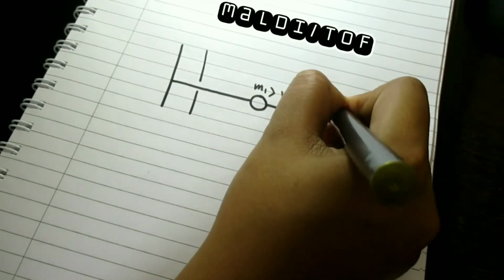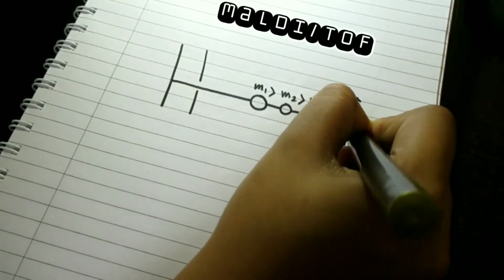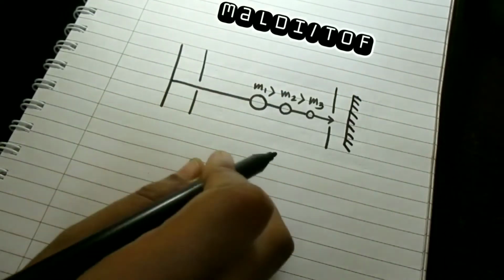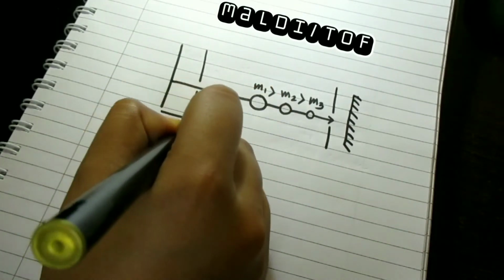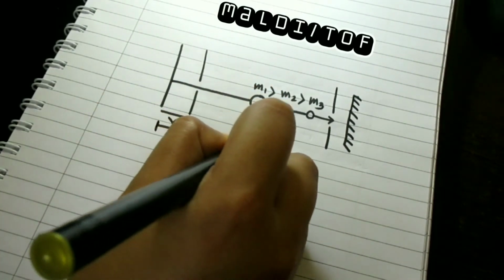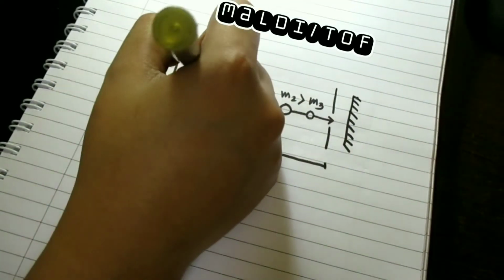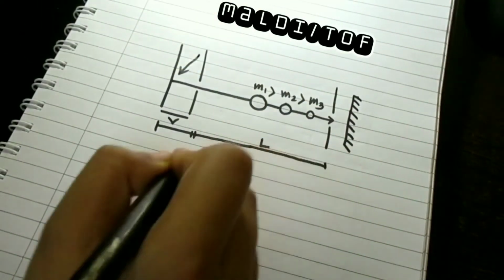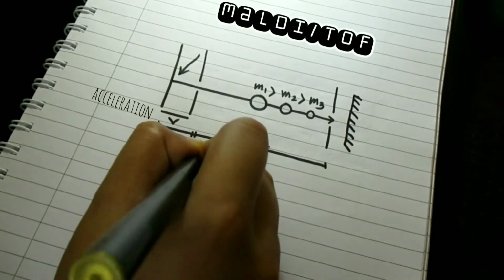The TOF mass analyzer measures ion flight time. It is based on the simple idea that velocities of two ions with the same kinetic energy will vary depending on the mass of the ion. The lighter ion will have higher velocity. Because the ions have different velocities, the ions reach the detector at different times.